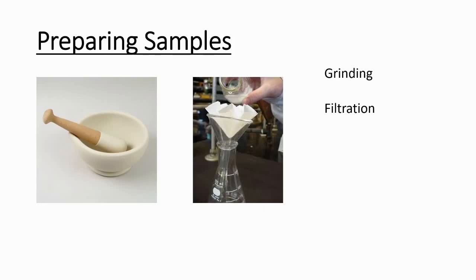Welcome to this video for A-level biology, and in this video I'm looking at testing for starch, proteins, reducing sugars and triglycerides. Before you test for these substances, you need to prepare the sample.